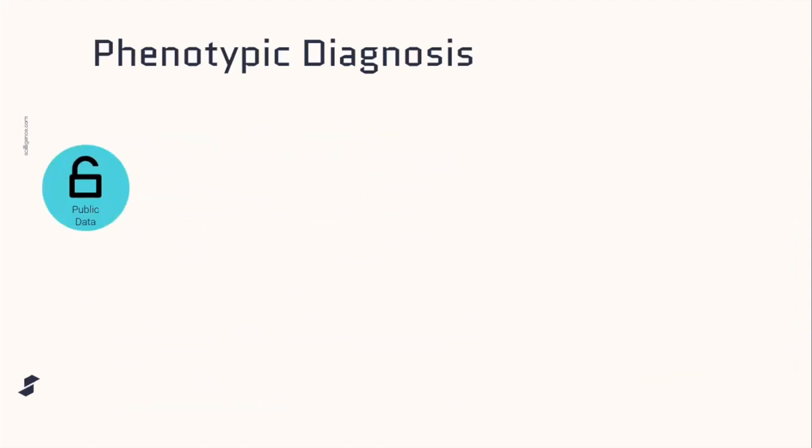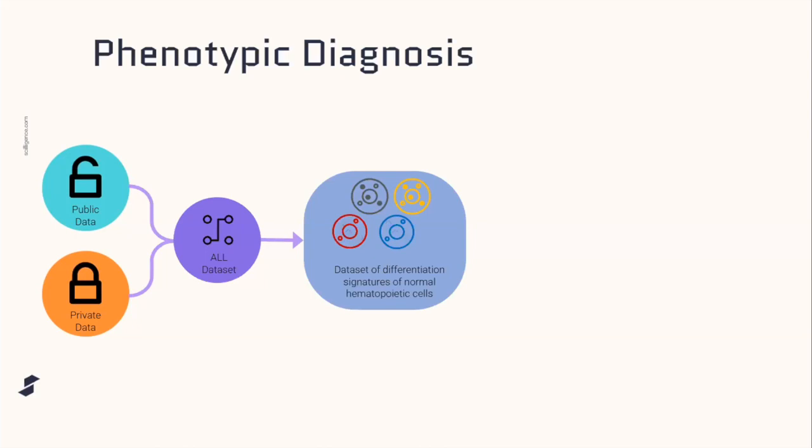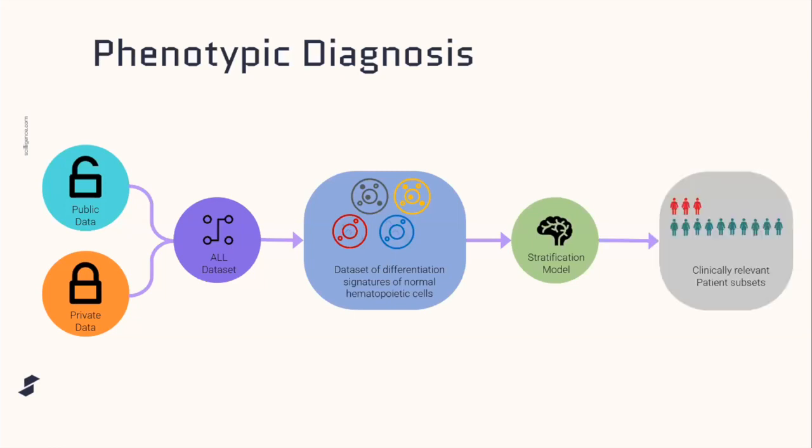What's also cool with this approach is that the examples I've gone through have used public domain data, which we've used to train our models, but we could also incorporate private data or specific patient data to create a very specified data set. We could train a model with particular patient clusters of lymphoblastic leukemia, making our model particular in a certain way so that you can stratify and find specific differences, and have clinically relevant output or results that we wanted to target. So again, this is just a use case. There are endless uses for this in different ways.